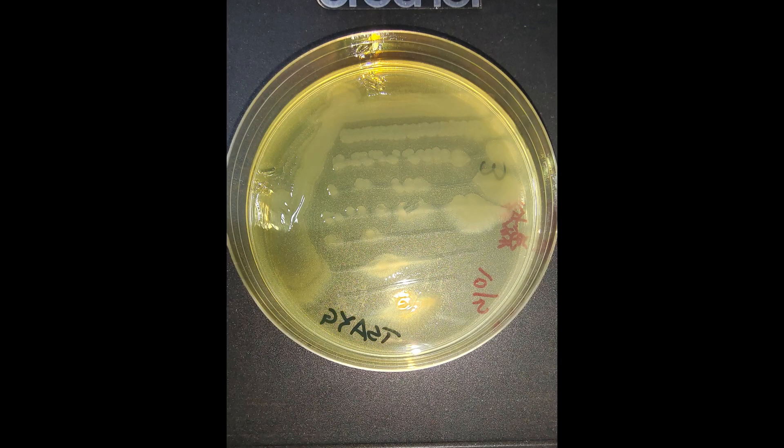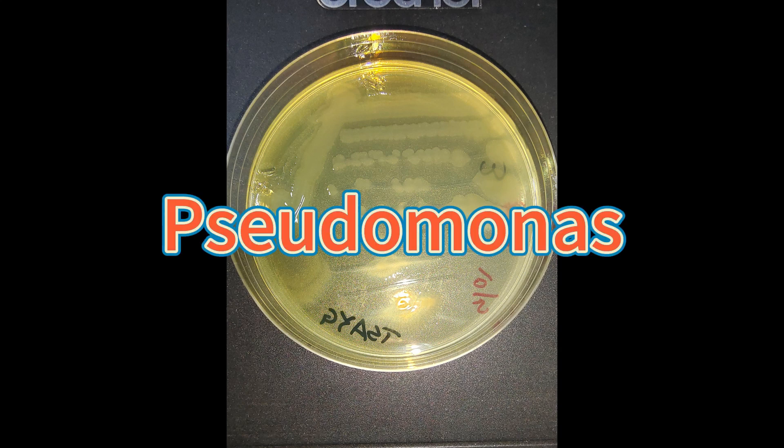The third bacteria is a gram-negative rod and green to yellow color, and it glows under UV light, so it's very likely to be Pseudomonas. Well, this one is also a very easy one. So we both got a point for Pseudomonas as the answer.